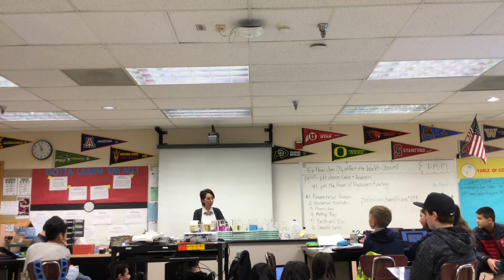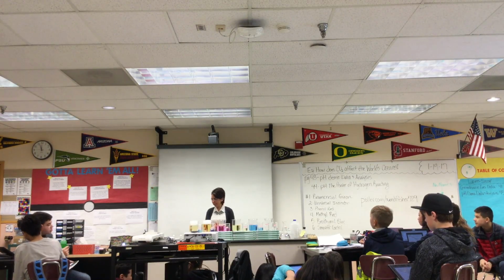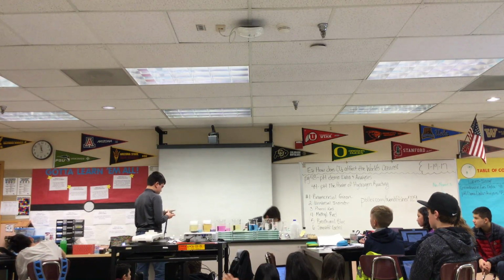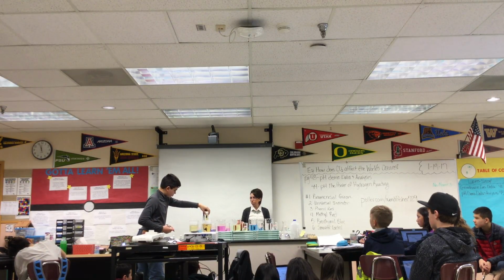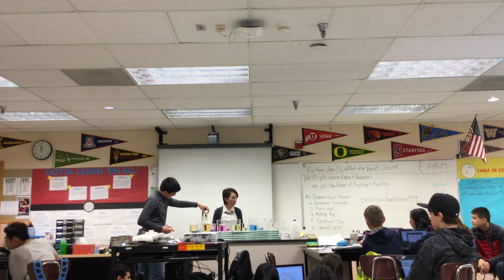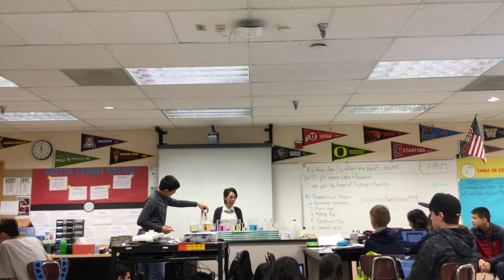Based on the color now, what's the pH? Around 6. Let's test it out. Are we around 6 right now? Just do like the first 2 centimeters in there. Yeah, around 6. All right. Going down. Yeah, it should keep going down. Why is the number going to keep going down? We still have dry ice in there, so the whole reaction hasn't happened yet.